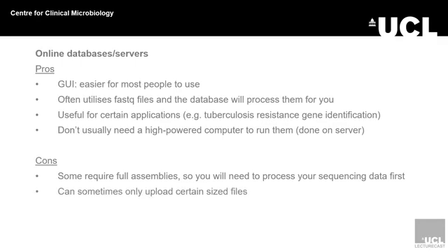As I mentioned, some of them you can only upload certain sized files to. Some of them have graphical user interface versions, and some of them also have command line interface versions. If you understand how to use the command line, some of them you can bypass the file size limit, because you can do it on your own computer. I think TB Profiler is an example of that. But yes, you just have to be aware that some of them can only do a certain amount.